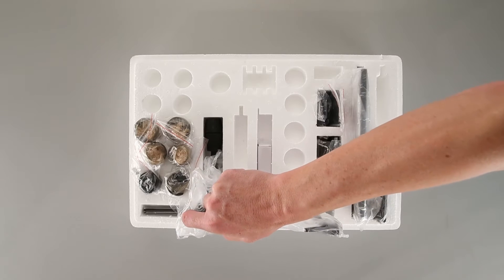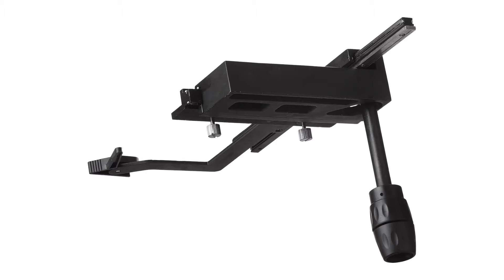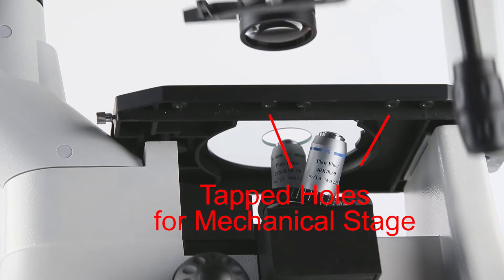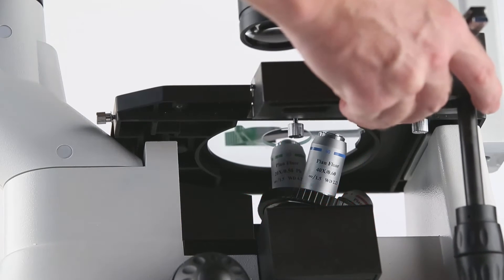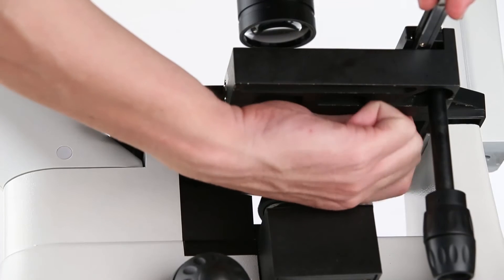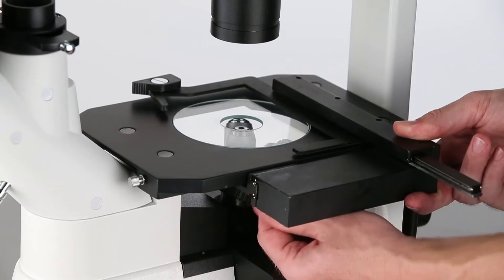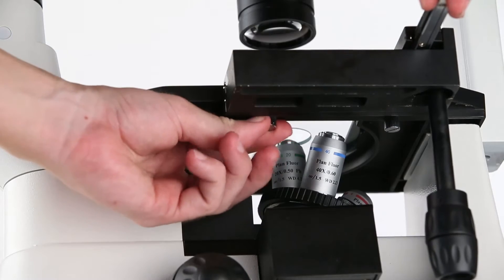Next, we'll attach the mechanical stage assembly. The mechanical assembly has two attached screws, which will line up with tapped holes on the underside of the stage. Fasten the locking screw securely.